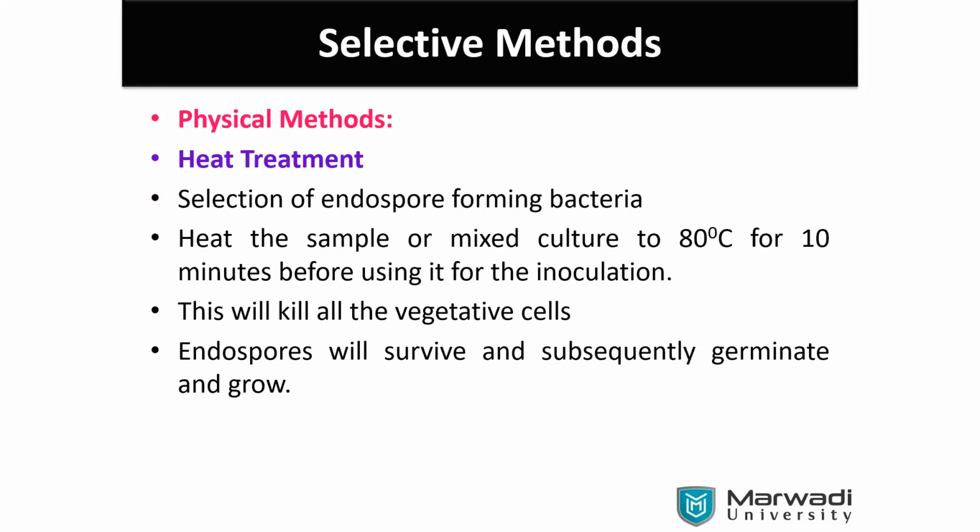Maybe you know about the spore, endospore. In the last semester, maybe you have learned about spore staining. Endospore, yeah, a dormant state. If you are looking for cells that are able to create a spore-like structure, we need to give heat treatment. Okay, how to do a heat treatment? Either on a plate itself, in a culture, or on a slide if you are doing staining.